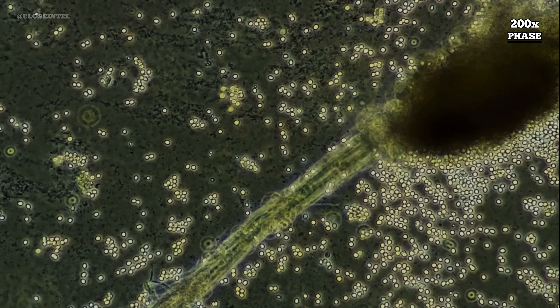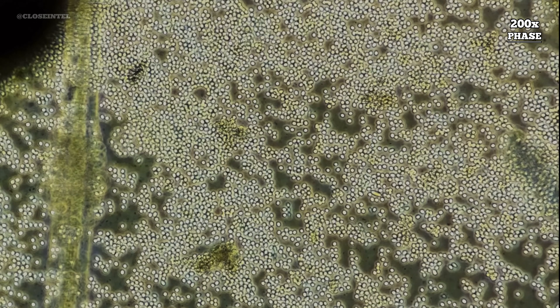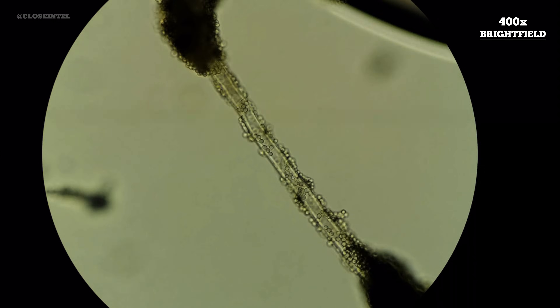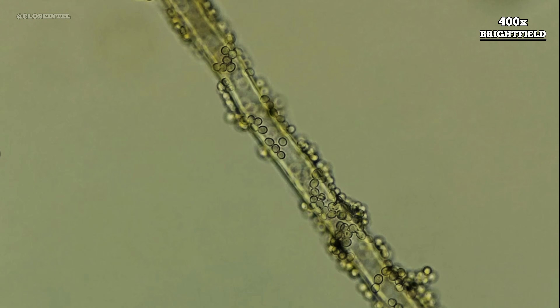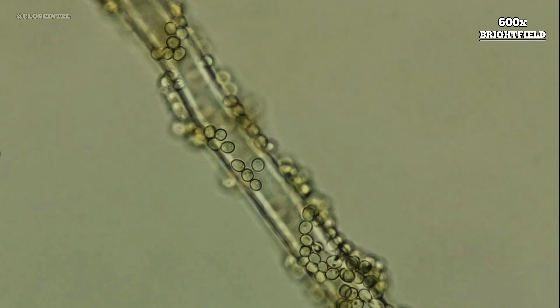Depending on the species, each sporangium at maturity could potentially contain thousands, if not tens of thousands of spores that are all ready to reproduce when the conditions are just right. Here are some clips of the stalks or sporangiophores up close, and you can see tons of spores wrapped around or stuck to the sides of them.